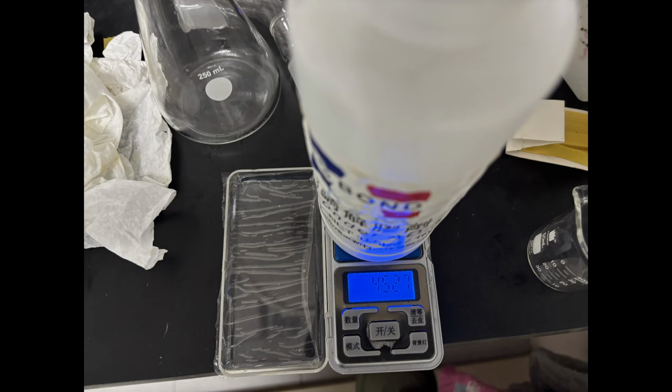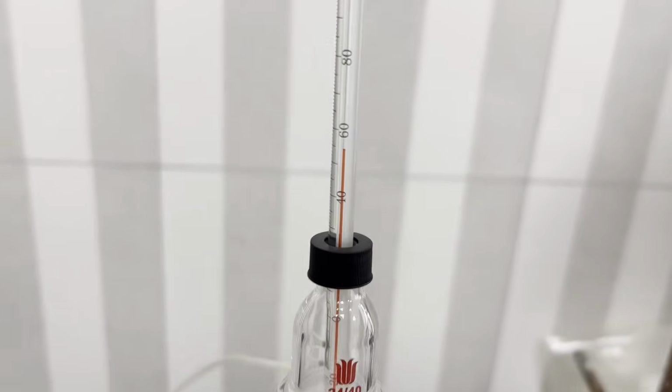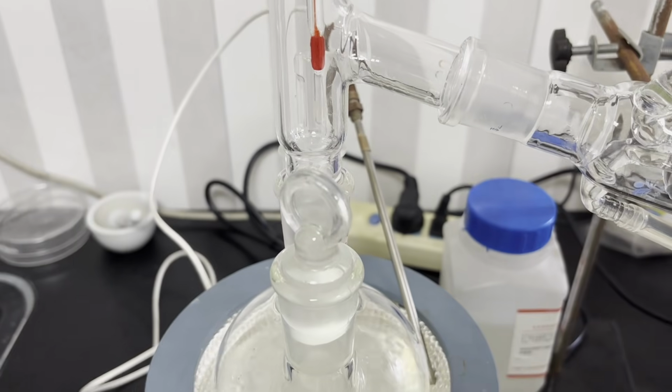The final yield of pure acetone is 413 grams, or 88.1% of the theoretical. Since I cut the second distillation when 50 ml of acetone is still in the flask, the reaction yield is very close to 100%, or quantitative.